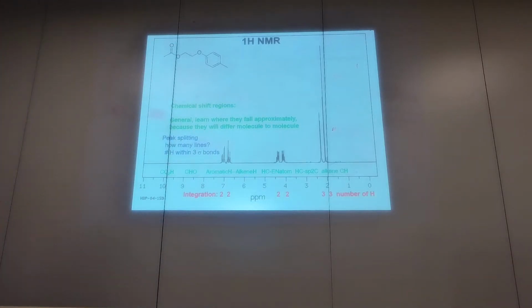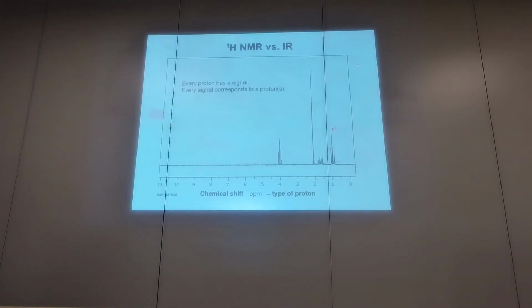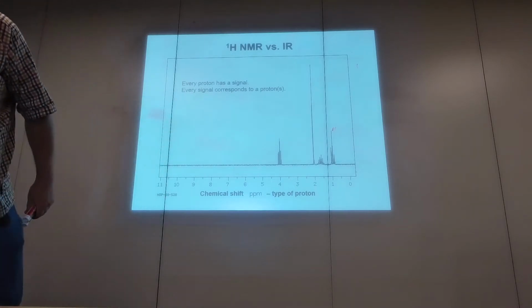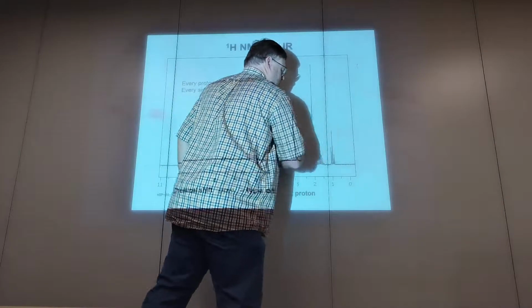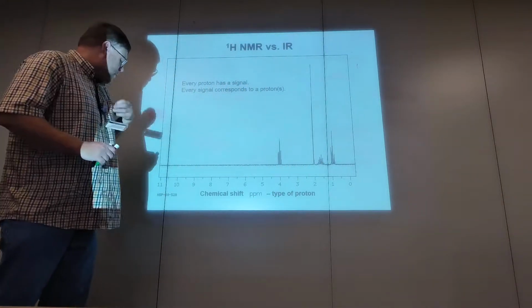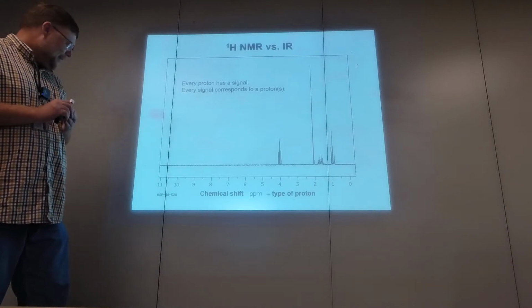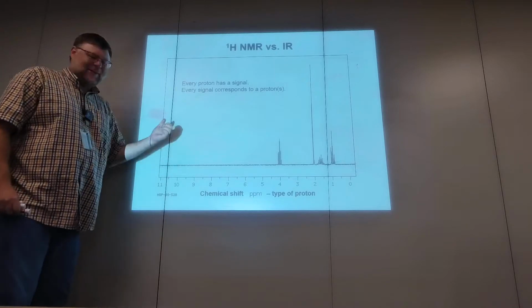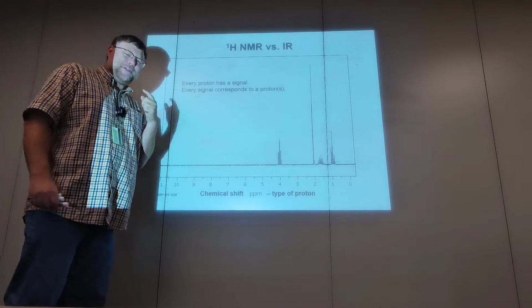All right, let's do another simpler molecule first. Oh, look at that. I like to do this when I lecture. Okay, so we've got a spectrum, and you see there's, jeez. This wall is not flush. I almost said a bad word.